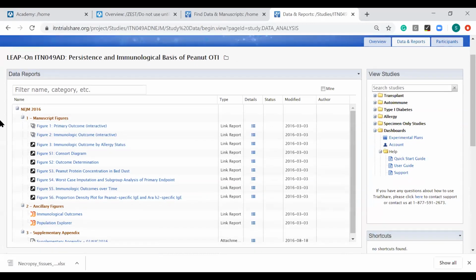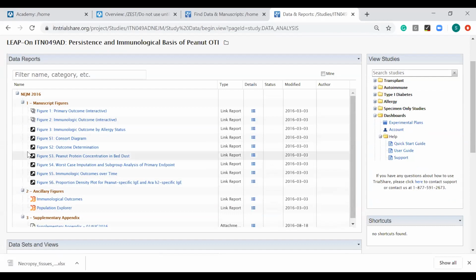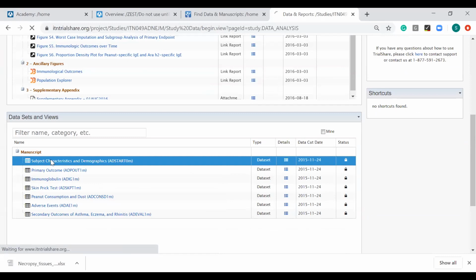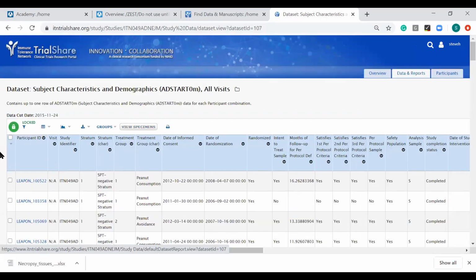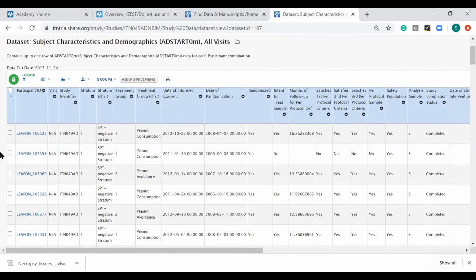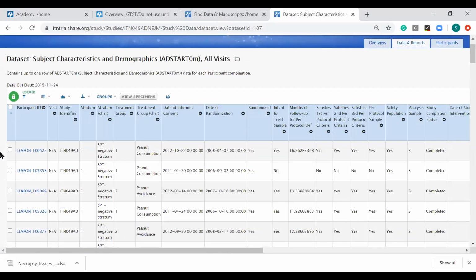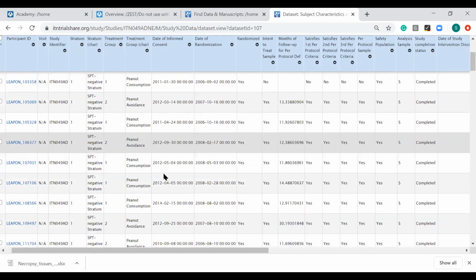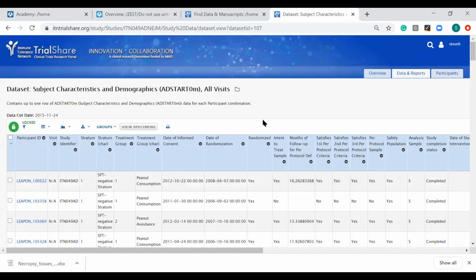Here is their list of base data sets. The base data sets are down here, and these are those data grids, just like we were looking at previously. They have so much data that they've done some styling here to shrink everything into these tiny little text fonts, just because it's so rich. But again, we have all the same control over these grids that we did back at the Open Research Portal.